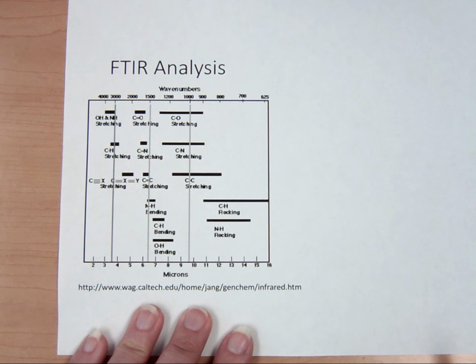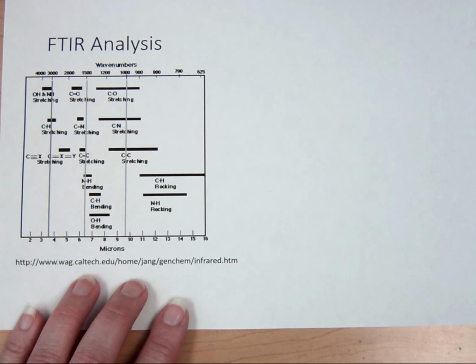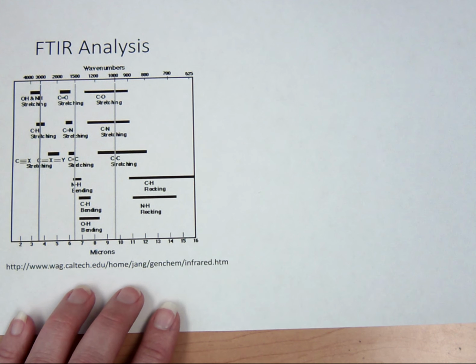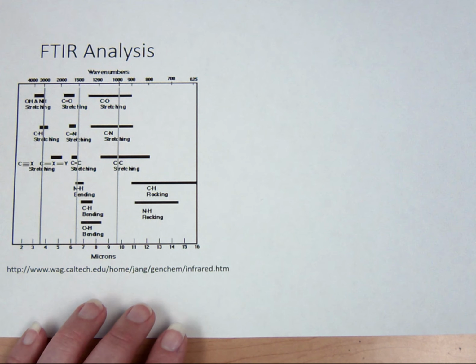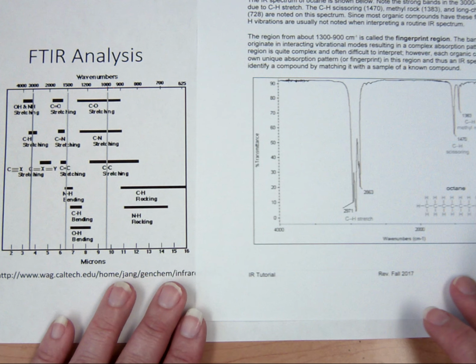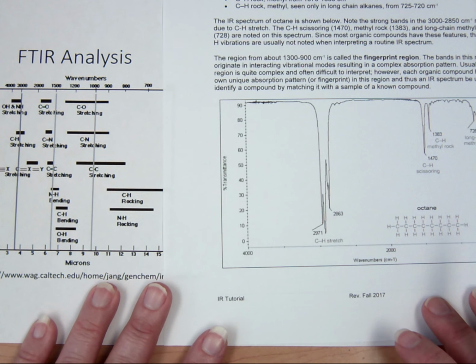So here's how I get started. I always keep a reference like this handy. You can draw one of your own using the guide on Blackboard, or find any of the others, or you can use mine as well. Okay, so I'm just going to use examples from the guide just to keep things consistent across different areas. But so here's an example.